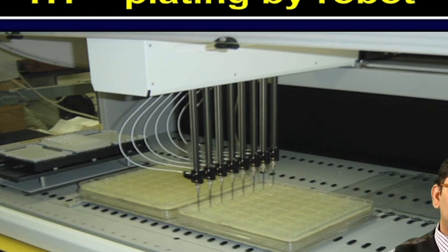The bacterial transformation can be plated by the robot onto the custom design bioassay dishes, which contain 48 compartments, as you can see in this slide. And these colonies can be further picked automatically by another robotic platform, which is a colony picking robot. In recombinational cloning, a high throughput method of doing transformation and plating is very crucial. Therefore, automation during the bacterial plating and colony picking reduces the error rates.